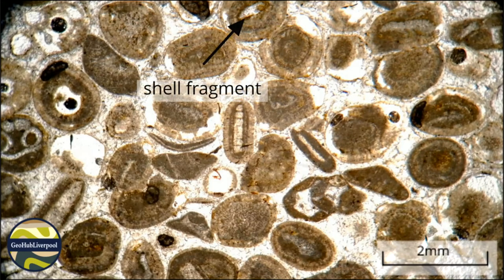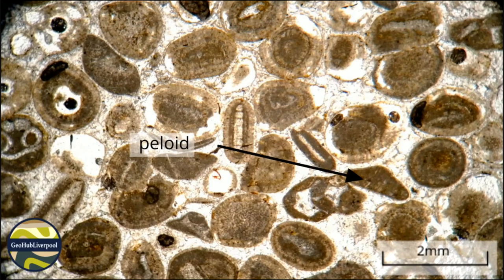Some ooids show concentric layers of micrite around a nucleus of paler material, which may well be a shell fragment. Peloids are more irregular or elongated; they are pellets of micrite and most of them don't show any concentric layering.